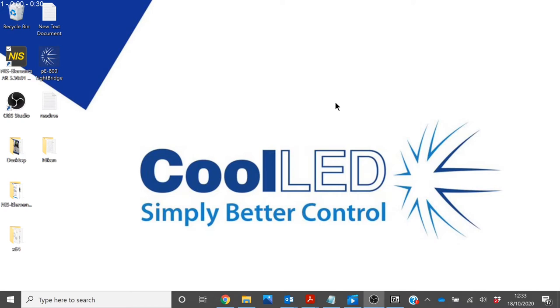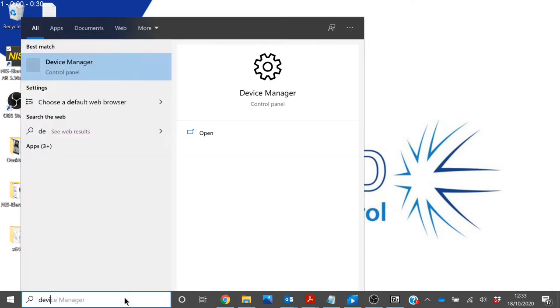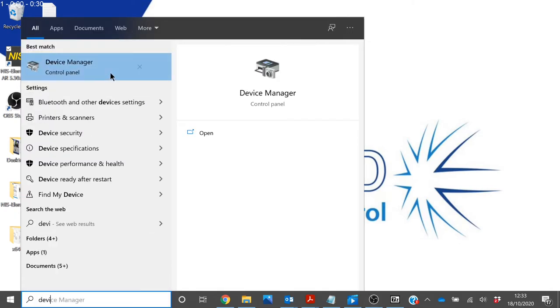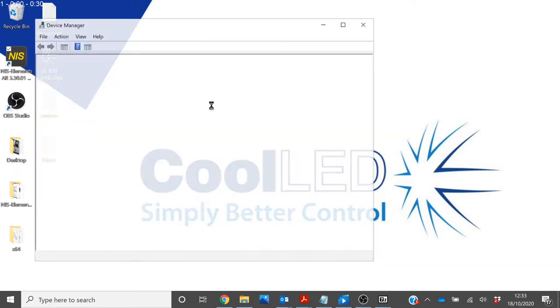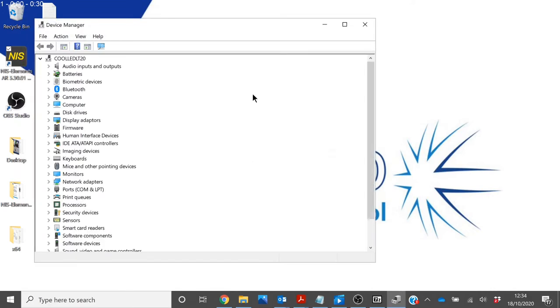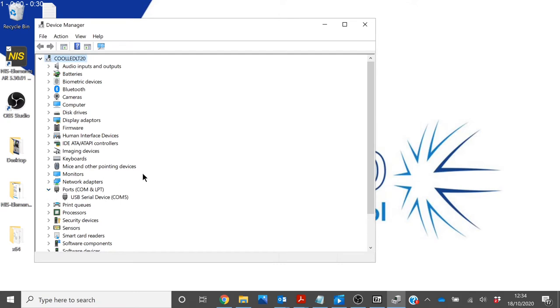To check that the computer has correctly recognized the PE800, you can open Device Manager. You will find the light source under Ports as a USB serial device. Make note of the COM port that it is connected to.